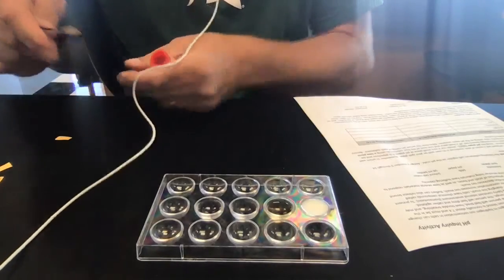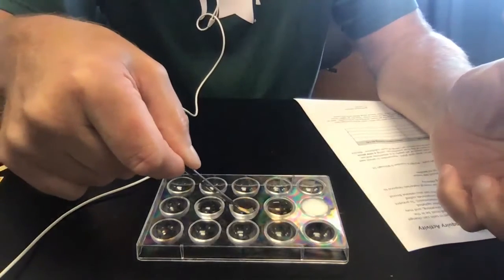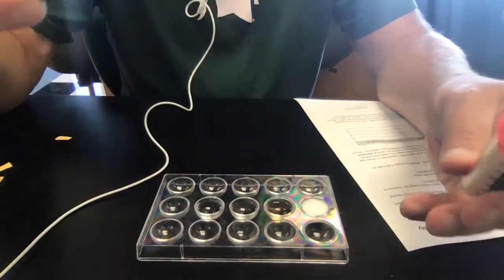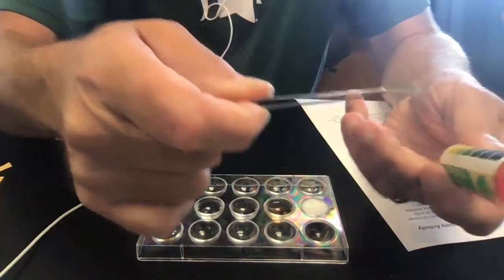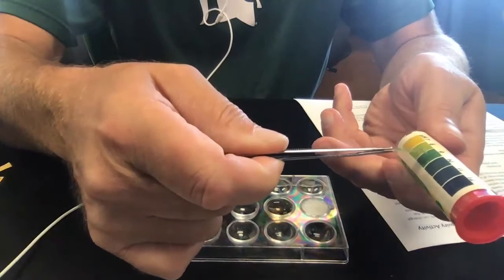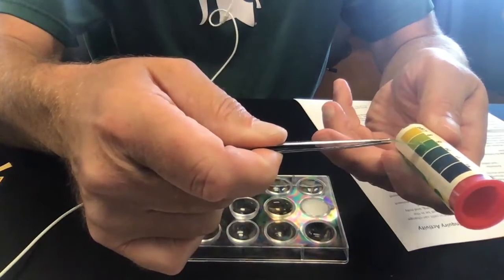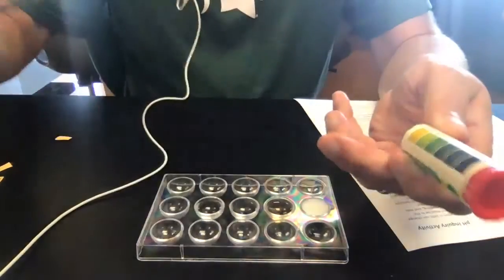Test our bleach or ammonia, which many of us know can be quite dangerous. And we see we get the other end of the spectrum. Bleach has a pH somewhere around 9 or 10. Looks like it's a little bit more of a 9 in this case. Some bleach solutions are much stronger. Some will go all the way up to 12s. But this one's a 9.